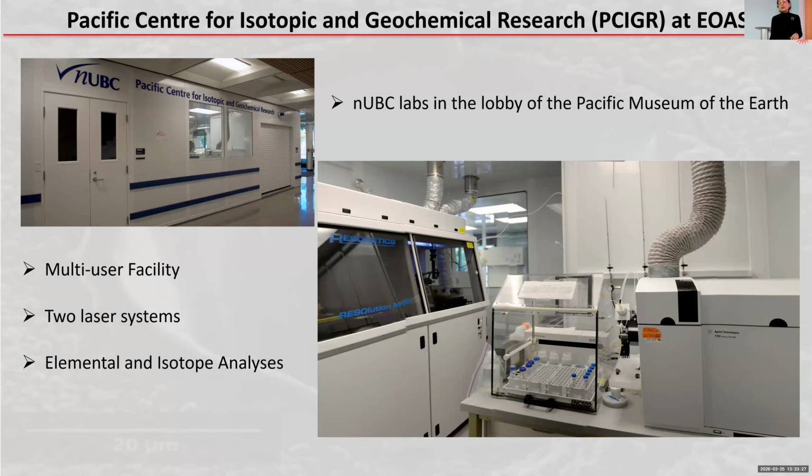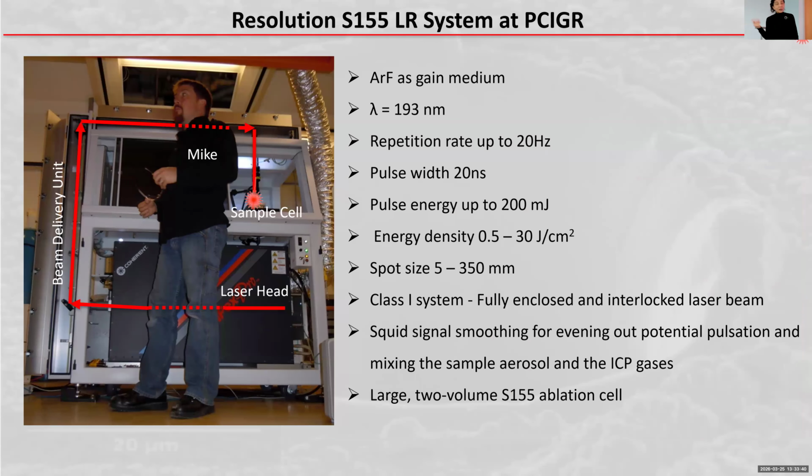And if you happen to come to the Pacific Museum of the Earth, in the lobby, you will see in that little window the laser ablation system residing. And if you're lucky, and I'm not lucky, we will have a service, and then you will see the panels open, and that is the laser beam path, basically.